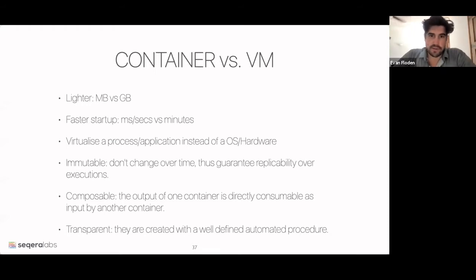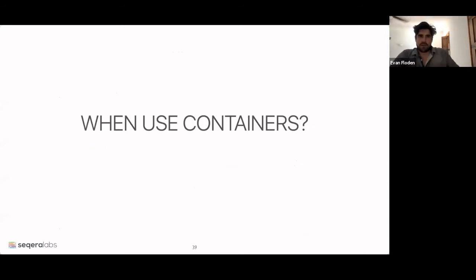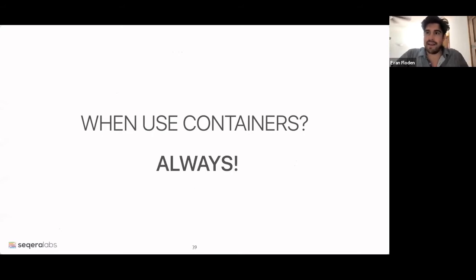And if we think a little about when to use containers, and I'll show you this later on, hopefully from this tutorial one thing you can get out of it is to really understand and be able to use containers always. Because it's really one of the biggest transformations that happen, along with workflow managers. Workflow managers make it so easy to use containers that there's really no reason not to.